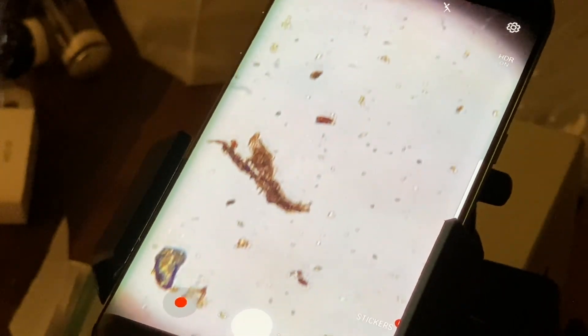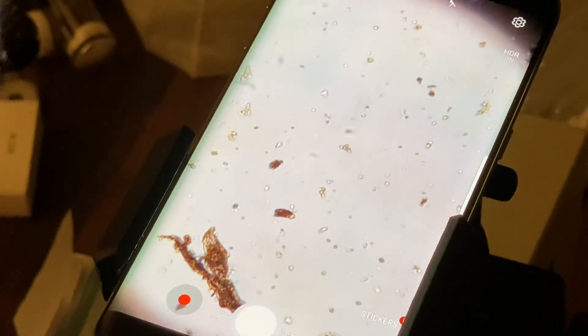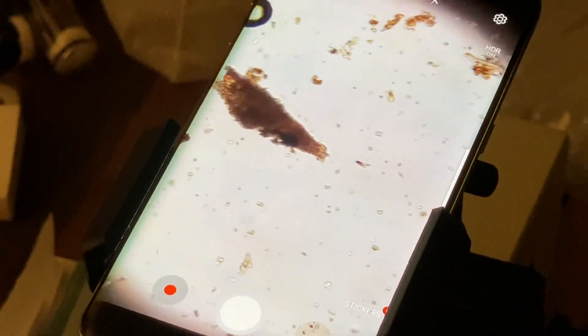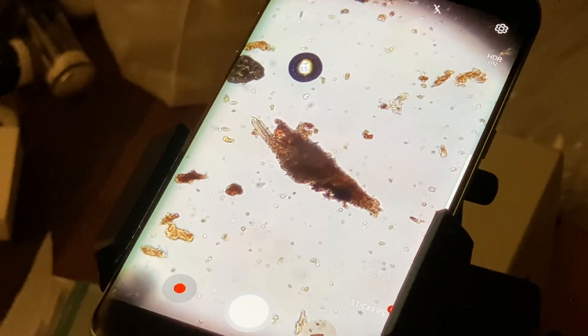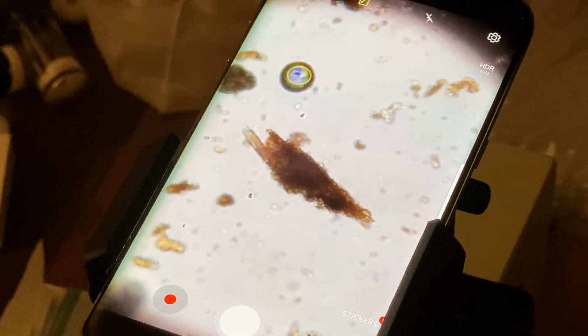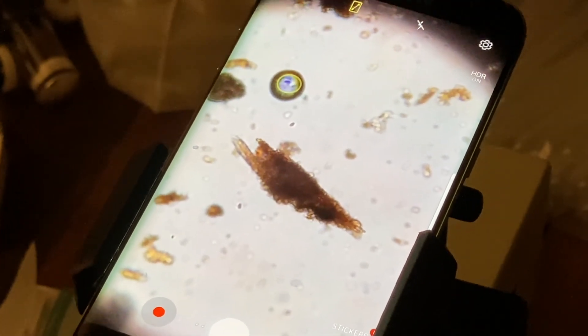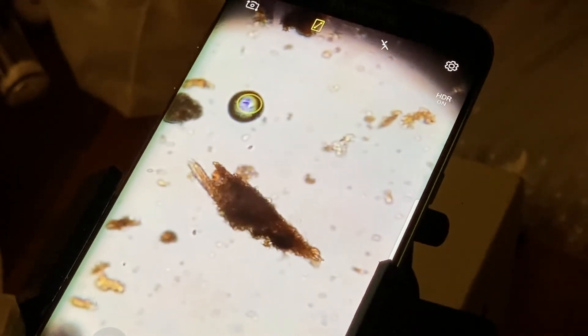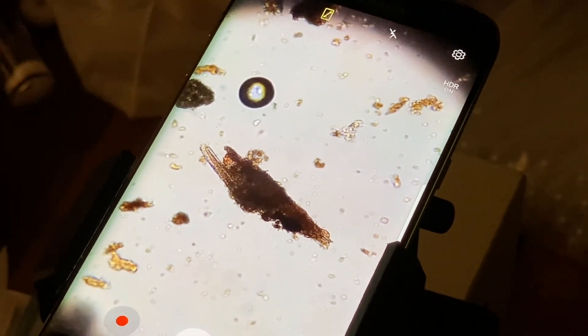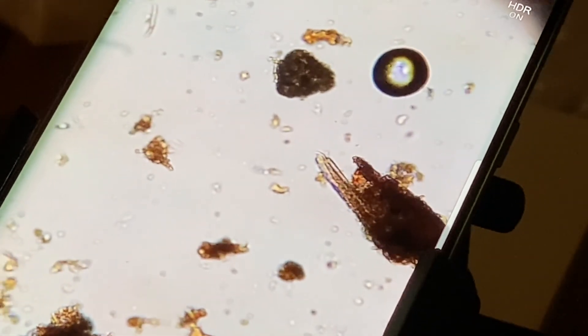That's a little bacteria. Not seeing too many rod-shaped bacteria, which is good. That's more like a humic acid — you can see the sort of crystal-y edges, it's a little bit more amber in color.